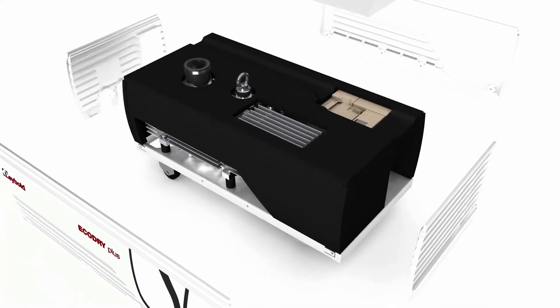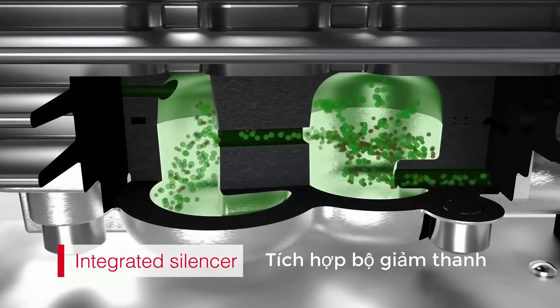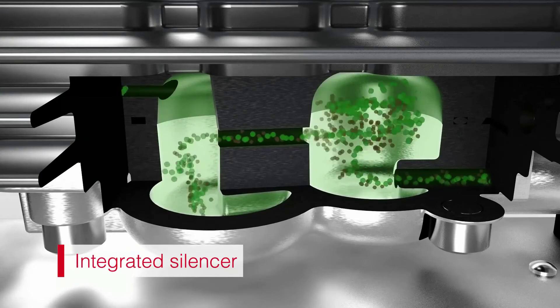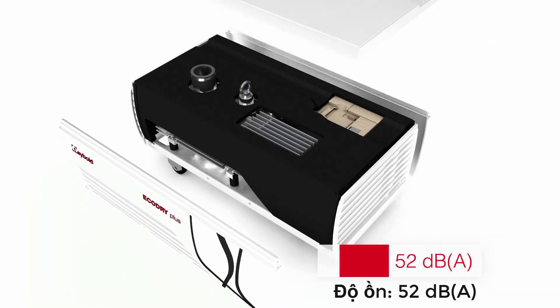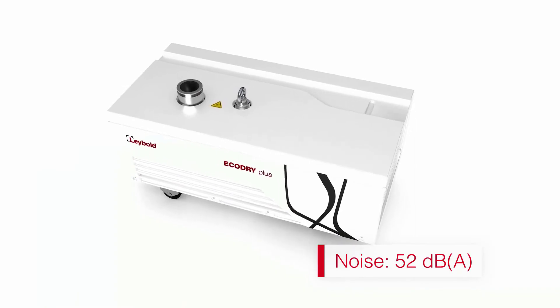The motor and rotors run exceptionally smooth. A silencer integrated in the exhaust ensures that the gas is discharged quietly, even at higher operating pressures. The acoustic insulation in the pump housing reduces operating noise even further. At just 52 decibels, the Eco Dry Plus is less than half as loud as other pumps.